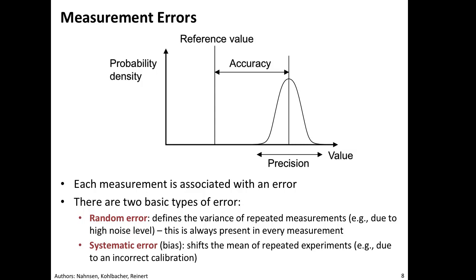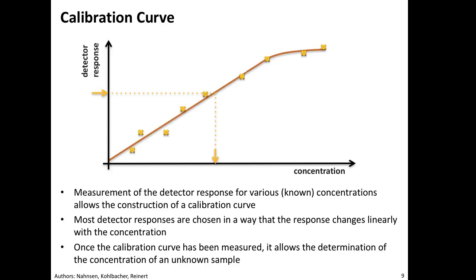Now, if you're an analytical chemist and you're going after a single compound, you're setting up an assay, for example, in pharmaceutical production, and you want to determine the concentration of your compound to monitor your production, then you sit down, develop a method. You usually have to document that. And what people then do is something like this, a so-called calibration curve.